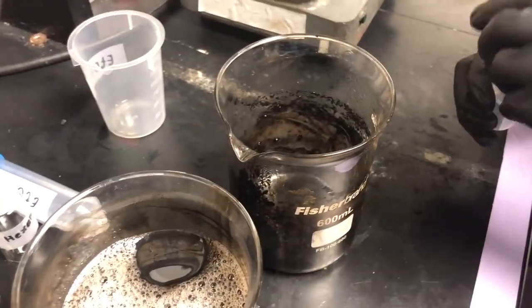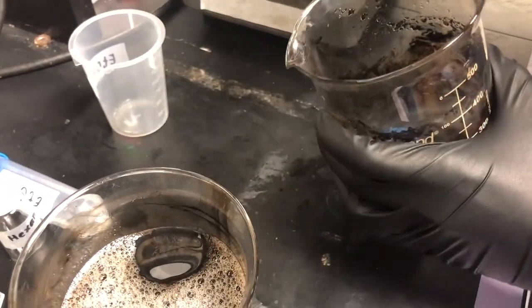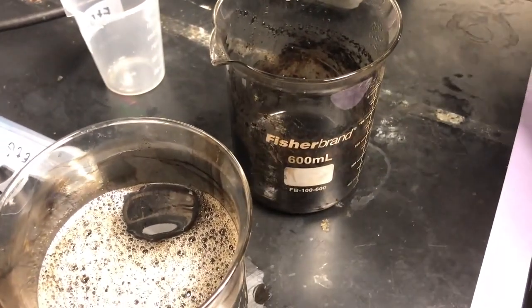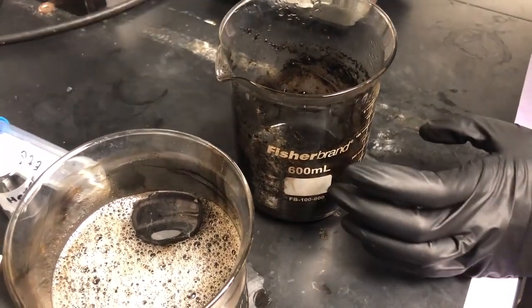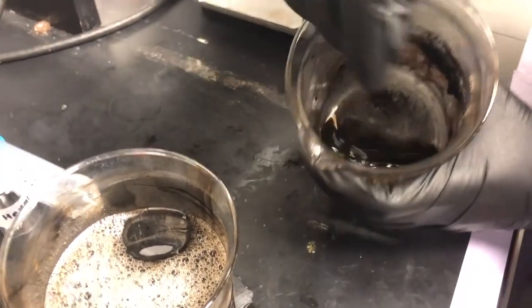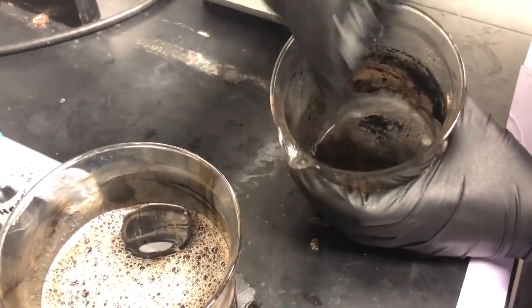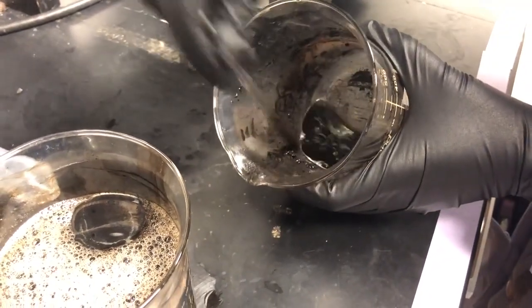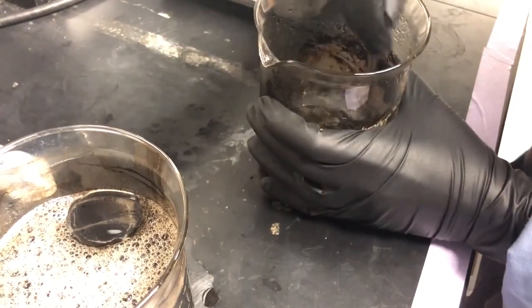Let's go for our second wash of ethanol. These ones can actually be a little bit quicker because once we get cleaner and cleaner, it just takes less and less effort to filter them out. Break up any of the larger clumps that you can find. If you miss some, it's totally fine.